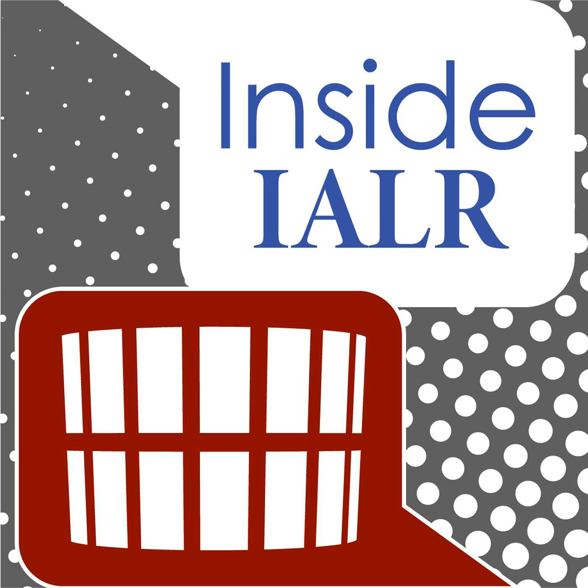We could do that. You could do that for different sections of the table, you could change the lighting? No, what we would do is change the light so different tables would have different lights on them, and we'd look at how they grow. There's other things.